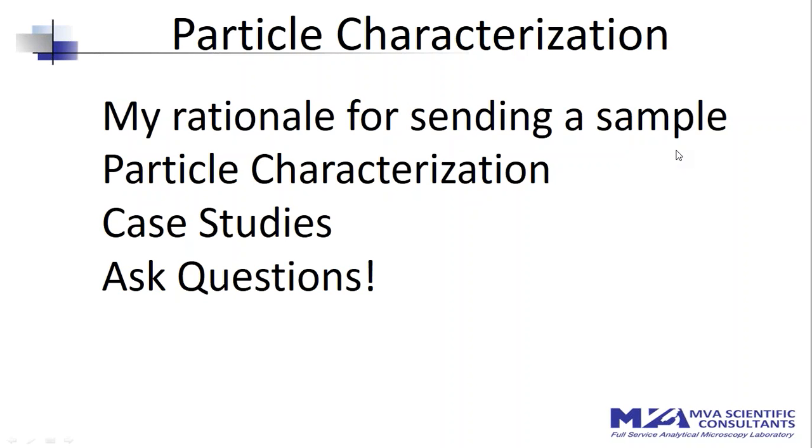As far as the rationale, if I have to send a sample out, and I do that occasionally, I usually have an expectation of what type of analysis I'm going to get from the laboratory I send it to. So it's always good for me to have a discussion with that laboratory, one, to give them a background about the sample, about my expectations, and anything that would help them in their work to get to a conclusion for this investigation. So that communication to me is very important.